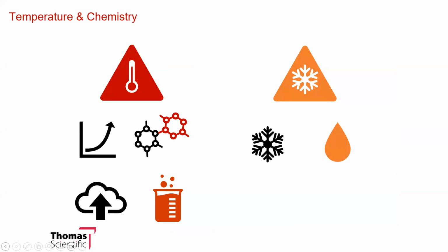Whenever you work at very cold temperatures and you're exposed to room temperature air, you get the accumulation of moisture on your sample. You can have different changes in structure. Sometimes freezing a sample will change its structure. And sometimes when you freeze a sample and it unfreezes, you start to get layering or separations of samples.